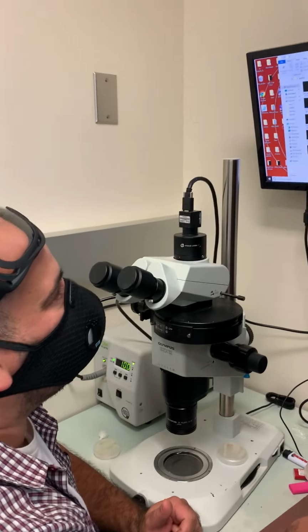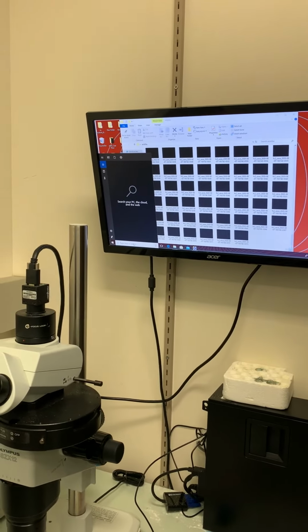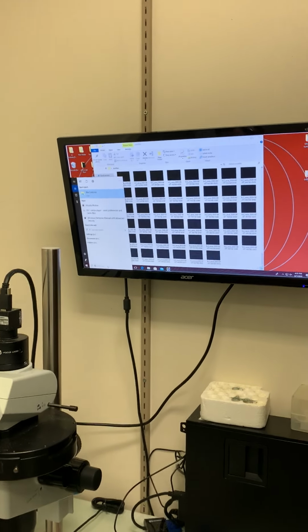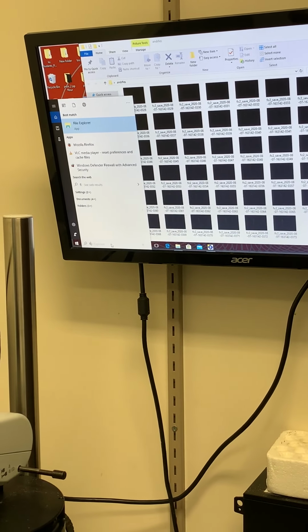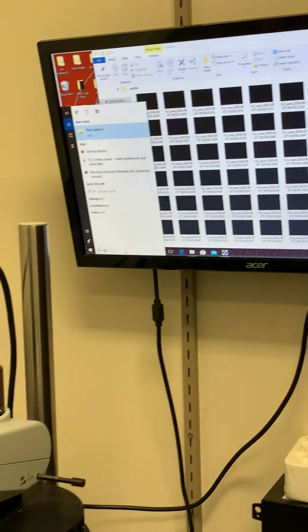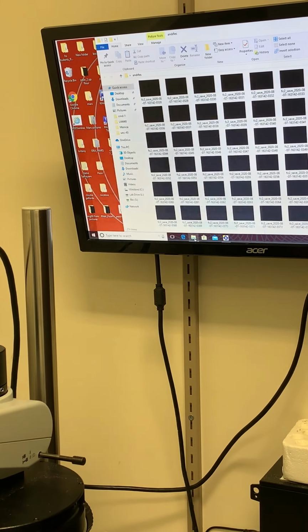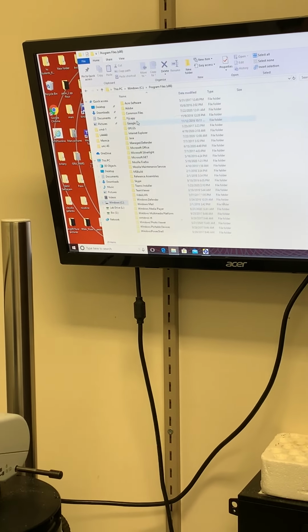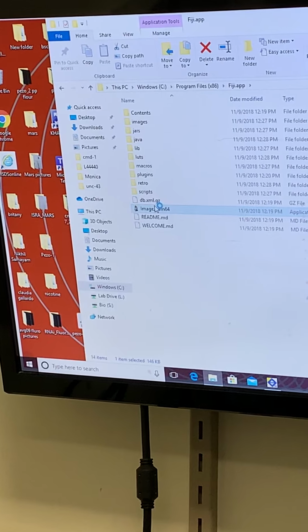So we are gonna now go to Fiji. Hopefully it's here. Okay, maybe I had to go to Windows, Program Files, Fiji app. There we go.